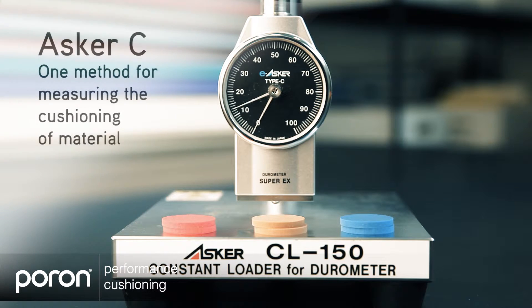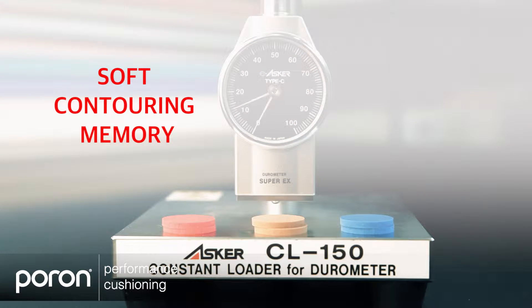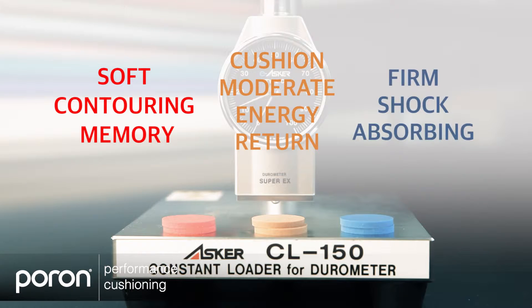Today we're at the PORON comfort lab and we have three types of PORON that we're going to test. The red PORON is a slow recovery material made for comfort applications. The tan material is a cushioning material for more active applications, and the blue is a firm material for a work boot where you're going to be standing on the material.